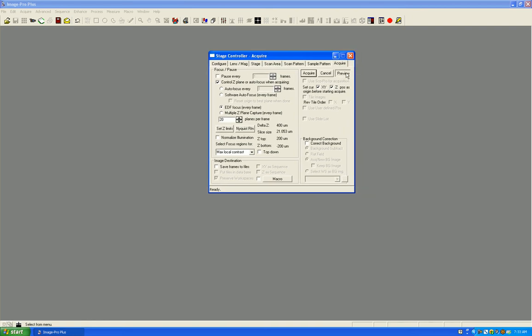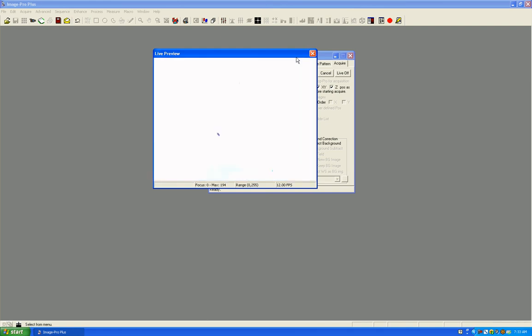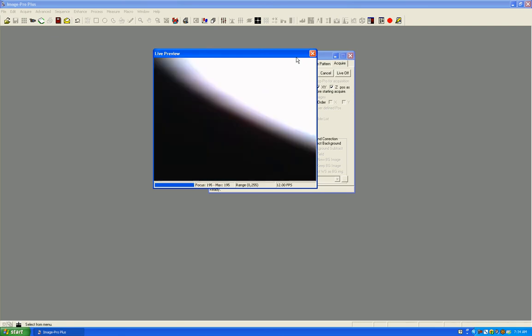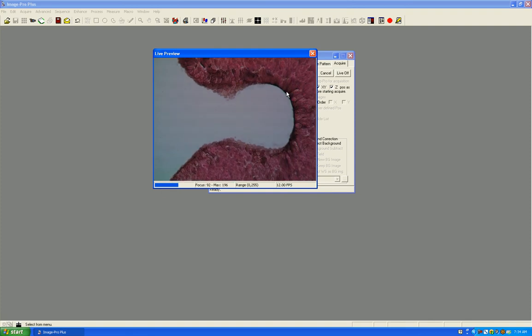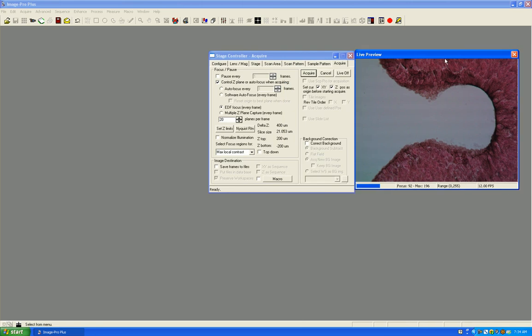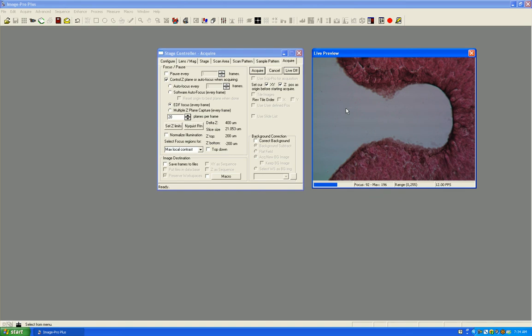I'm going to now go to a preview window of what's in my microscope, and looking through the eyepieces, I'm going to go to a lower power objective so I can find my object, which I moved into the field. Go back to the 20x, which I have now, and I'm moving an object into the field of view. Depending on your particle size, and I'm focusing the image, you want to effectively set up the appropriate lens to see the particles of a reasonable size.